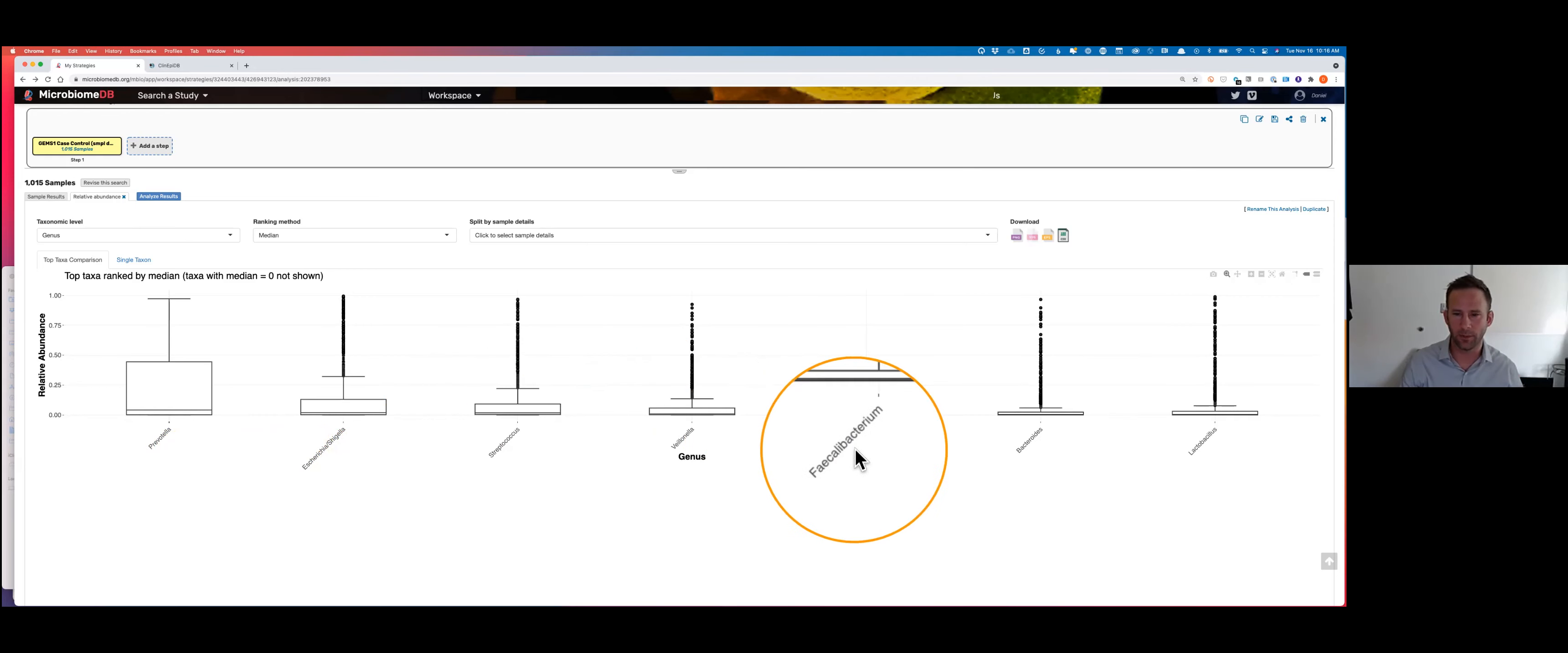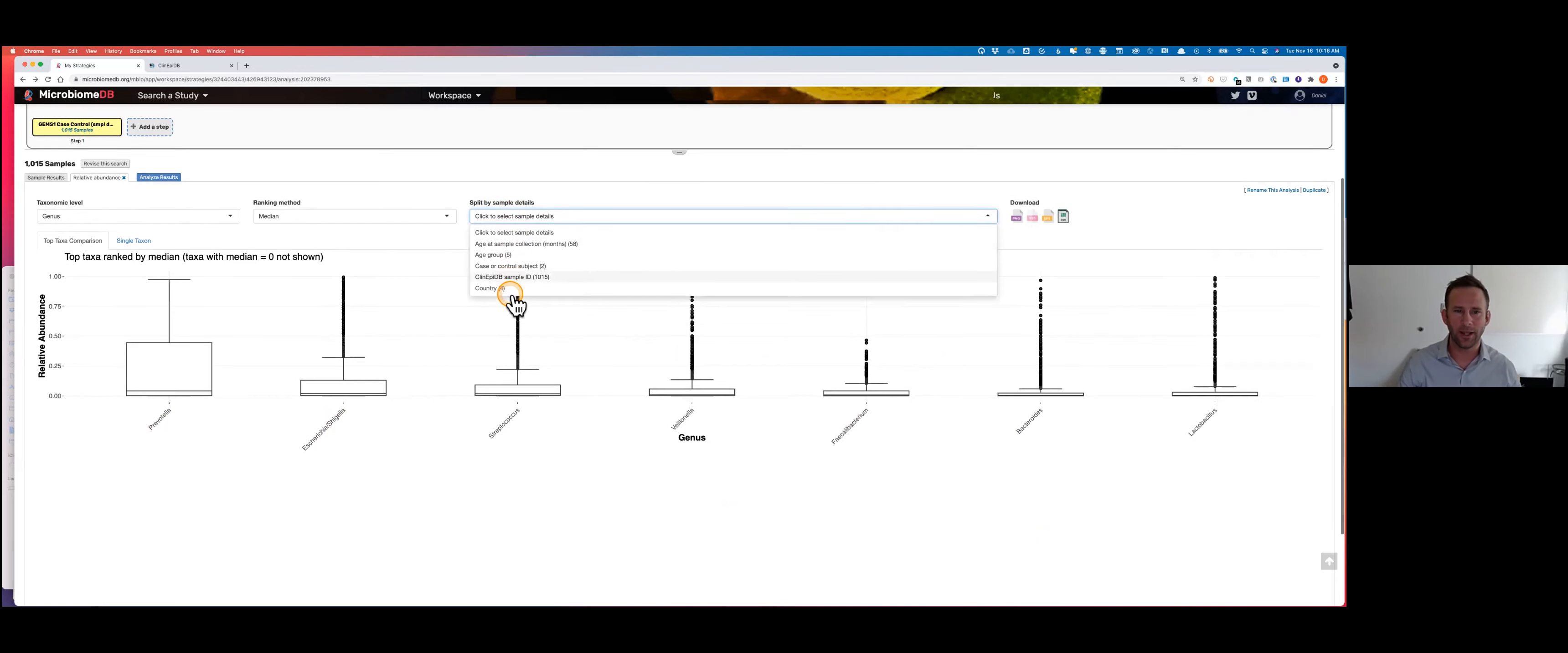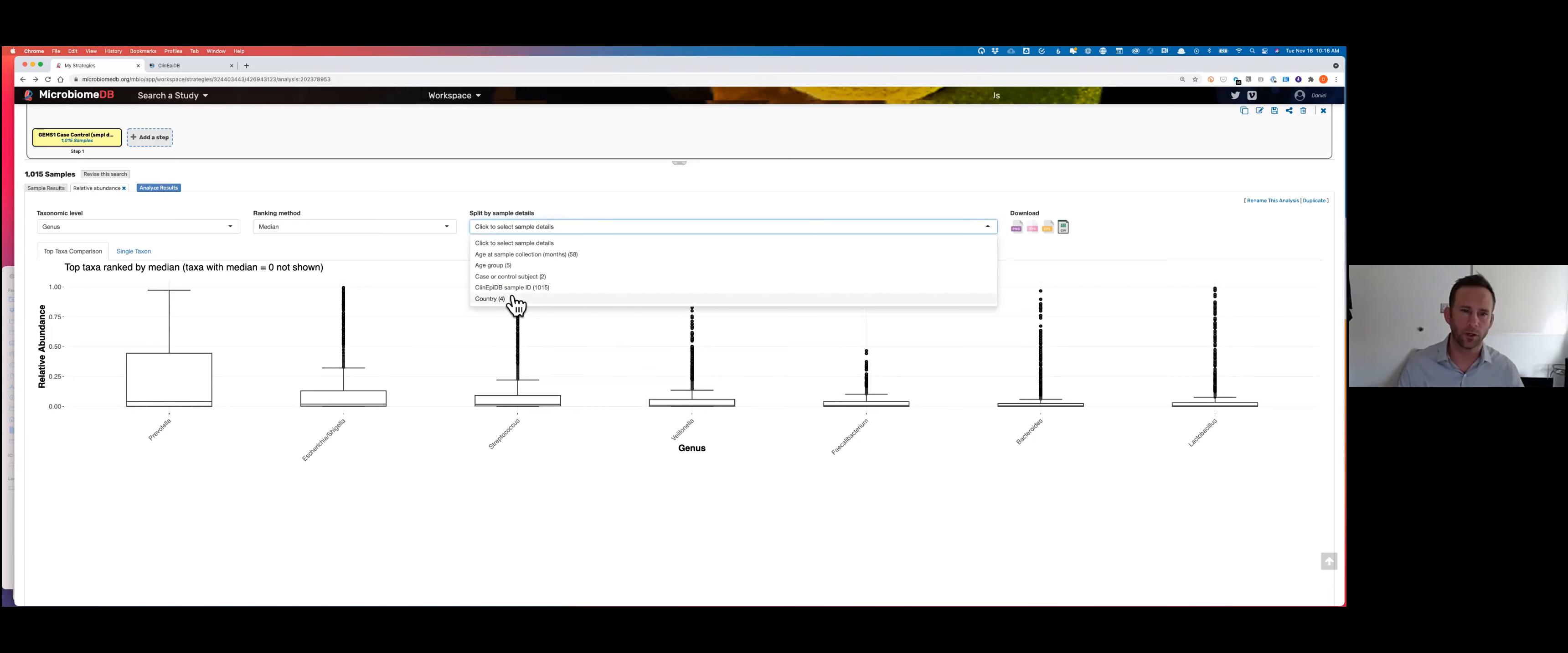The default display shows bacteria at the phylum level - very high up, kingdom phylum class order family genus species. It's showing the top four phyla by median abundance. It hasn't looked at any of the metadata yet, so this isn't that useful. I'm going to click on this taxonomic level and go down to genus. Now instead of high-level phylum, I'm looking way down at genus. I can see that Prevotella is the most abundant genus in the stool of these children from GEMS, followed by Escherichia-Shigella. E. coli and Shigella are so similar that they're difficult or impossible to tell apart by the method used here. Then Streptococcus, Faecalibacterium, Bacteroides, and others.